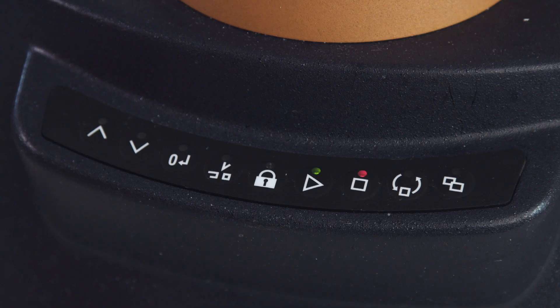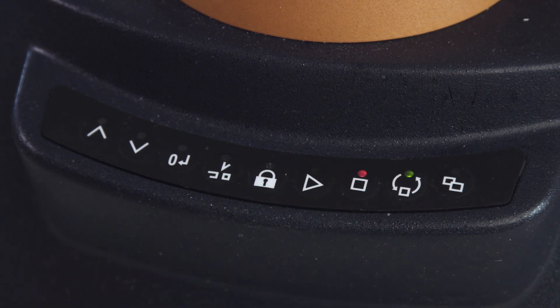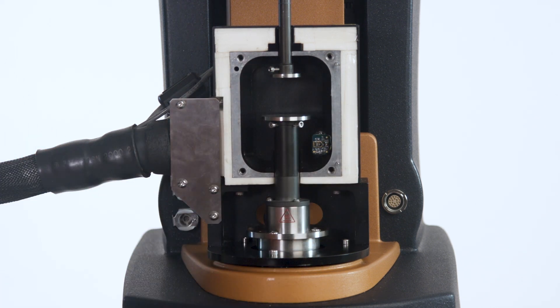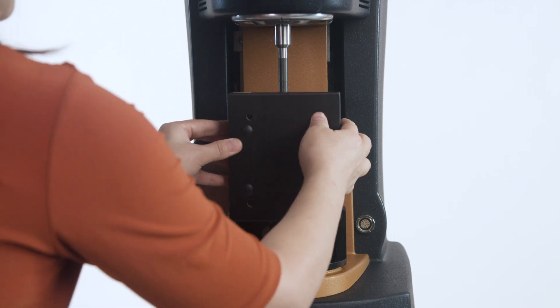Press the release button on the instrument keypad until you see a continuous green light. Insert the bottom geometry stage. When the green light is off, the bottom geometry stage should be locked in position. Install the front half of the sample chamber.